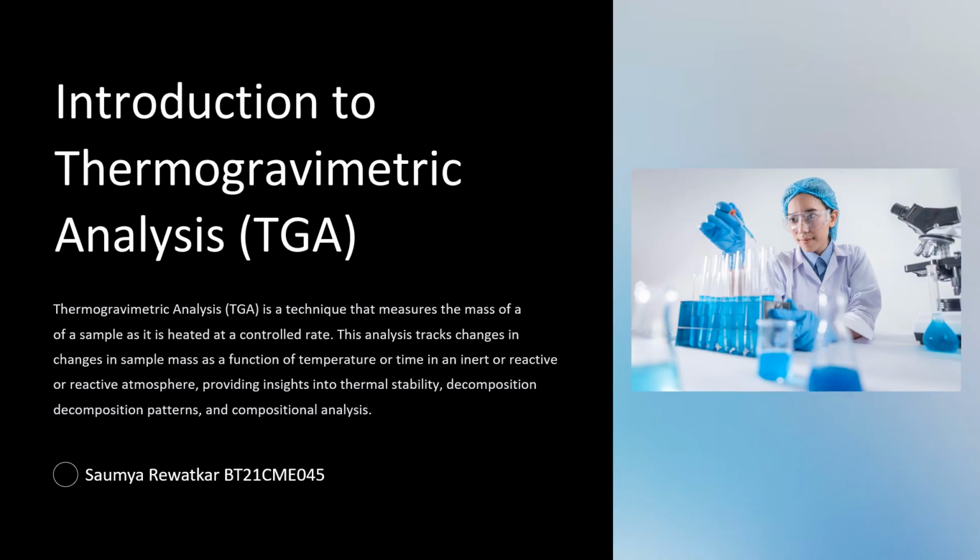It is widely employed in material science, chemistry, and polymer industries to study thermal stability, composition, and decomposition characteristics of material. The weight changes are recorded as a temperature increase or decrease, providing insight into physical and chemical phenomena like degradation, decomposition, and oxidation.